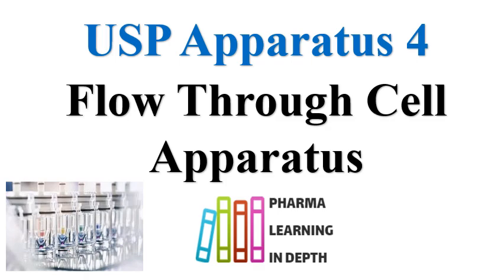I request you to read more and understand about it, because many times this apparatus is not used as it is complex, and it is required for dissolution testing of some specialized and complex formulations.